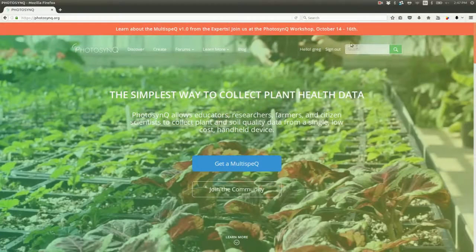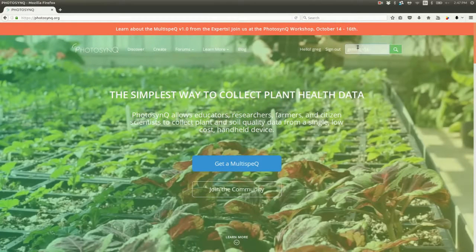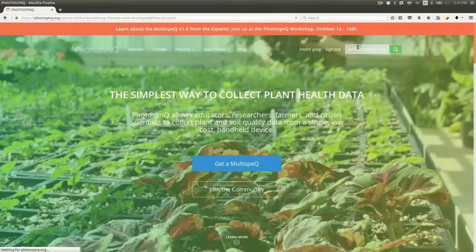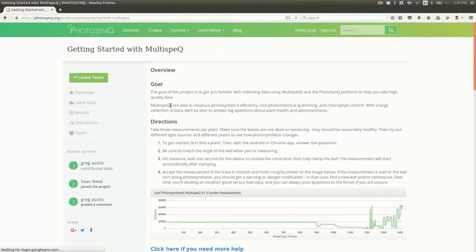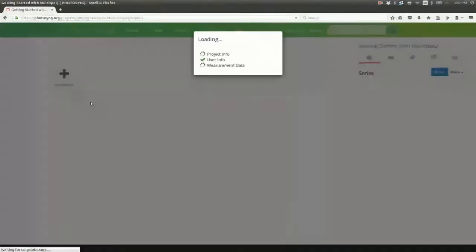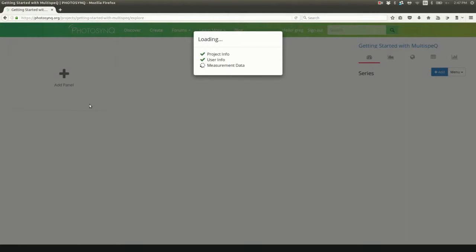Go to the project page and click View Data. Wait a moment for the data to load. This may take a few minutes for very large data sets, and it depends on your internet connection speed.